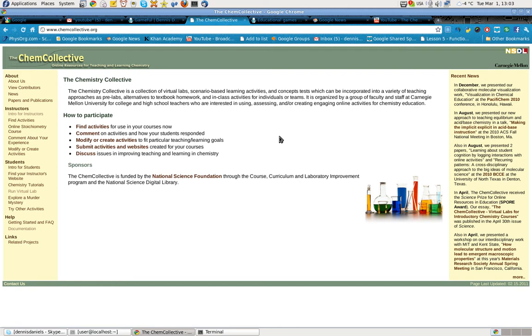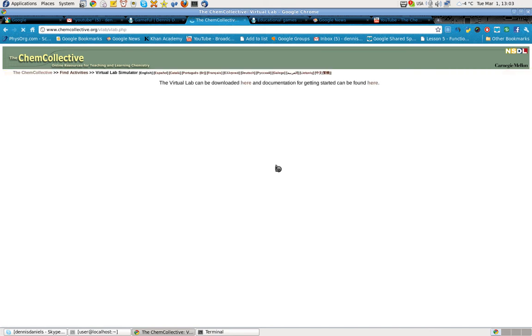All I can say is wow, very challenging, not only for myself, well mostly for myself because I'm not a chemist, but the tools are quite compelling. One of the things we want to show you is running the virtual lab.